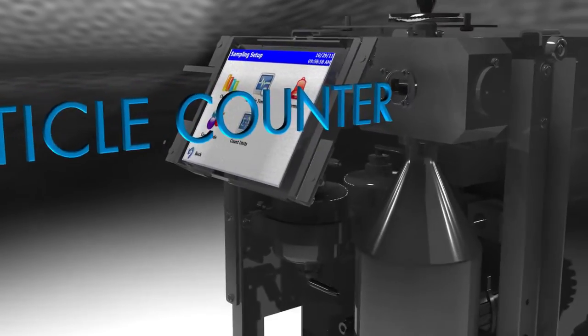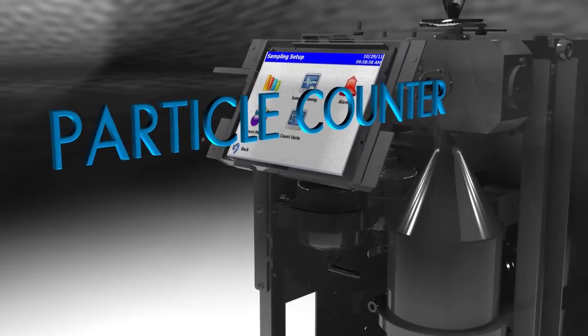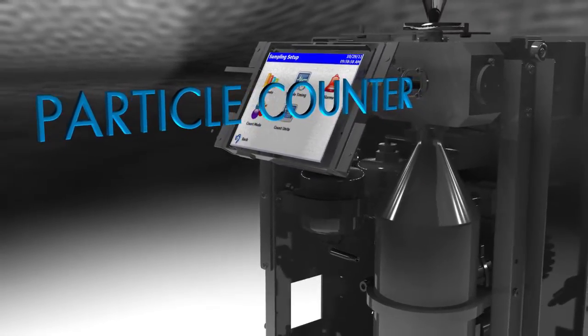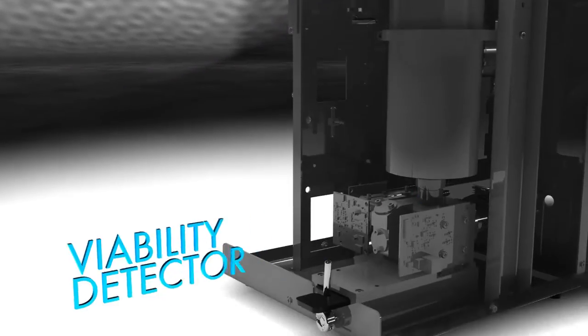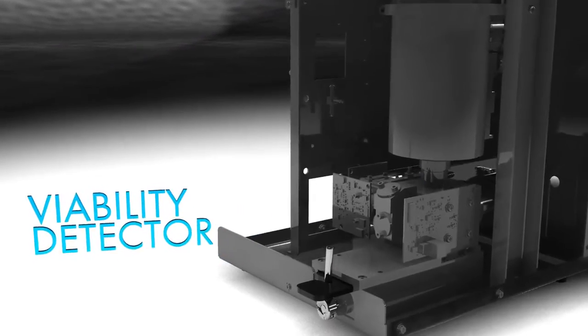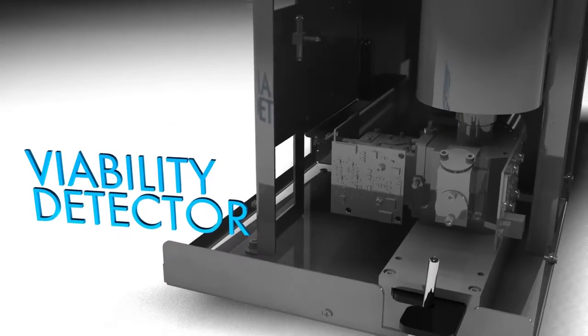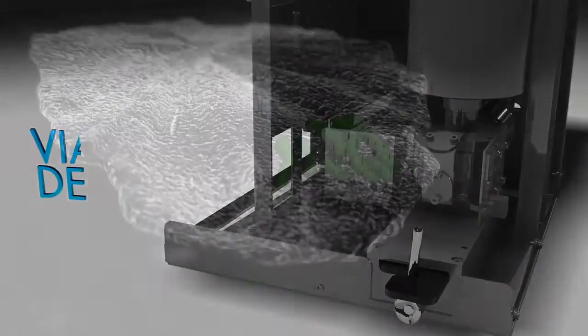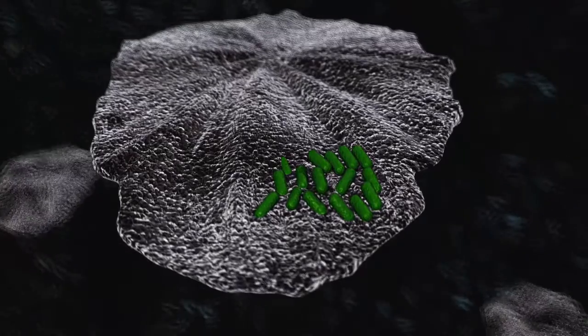Three instruments in one. The Biotrek particle counter first counts and sizes particles, just like an existing optical particle counter does today. Each particle is then individually analyzed for viability using TSI's patented three-parameter laser-induced fluorescence detector.